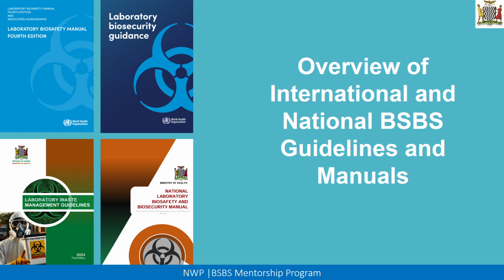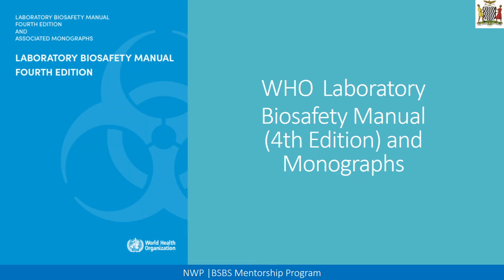And then under the national, we'll look at the Zambia National Biosafety and Biosecurity Manual, as well as the Zambia National Waste Management Guidelines. Then also under the Laboratory Biosafety Manual, we're going to look at some of the monographs that are associated with it, specifically for the 4th edition that is most recent at the moment. So let's get into it. Let's start with the Laboratory Biosafety Manual, the 4th edition, and the associated monographs.